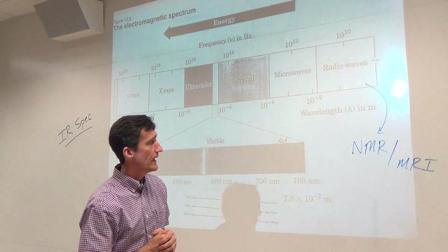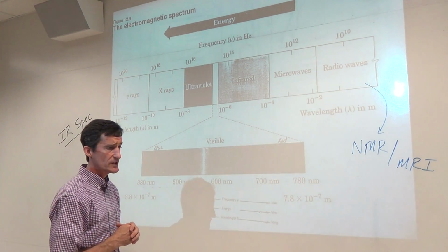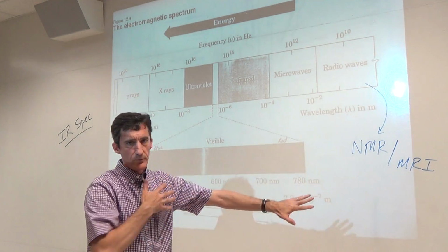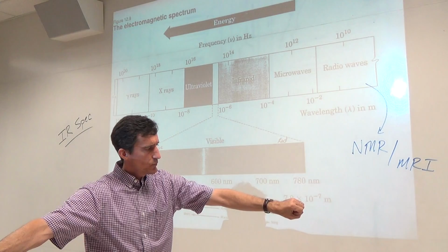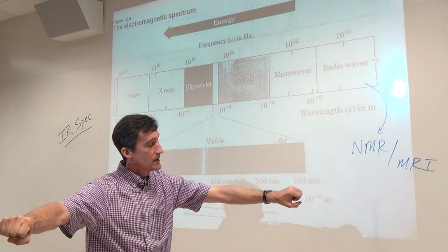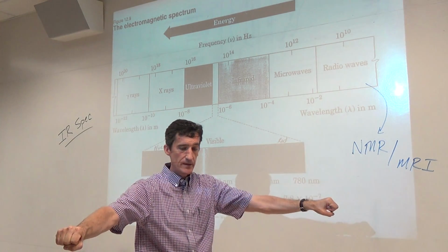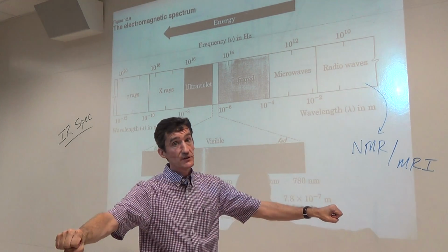Other peaks, particularly peaks in the fingerprint, which we're not going to interpret, many of those come from other vibrations. We can have vibrations where maybe the molecule as a whole starts vibrating. We have maybe multiple atoms. Let's look at this. We could have 3 atoms: 1, 2, 3. We can do an individual stretch at a certain frequency. But we can also maybe do something where both bonds are stretching, and maybe that's at a different frequency.